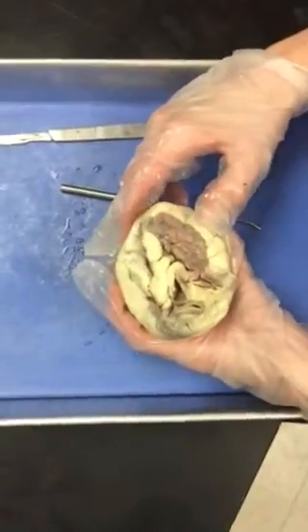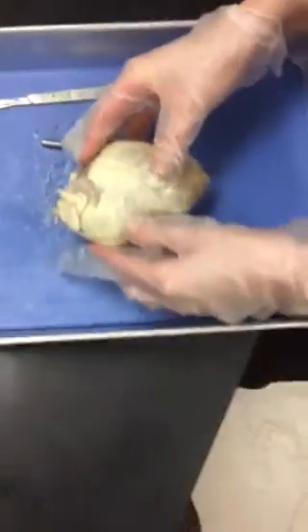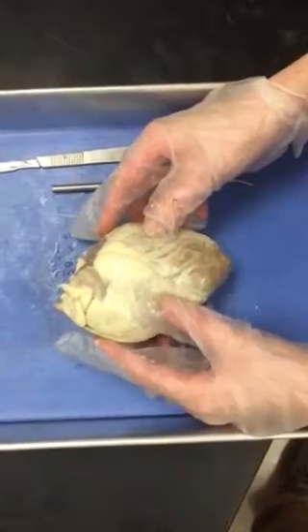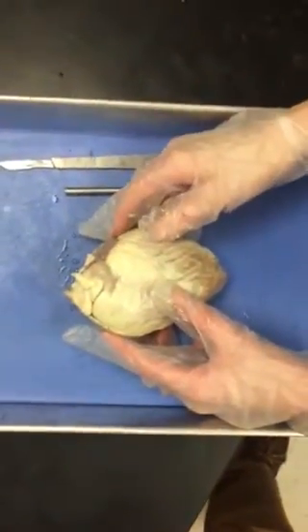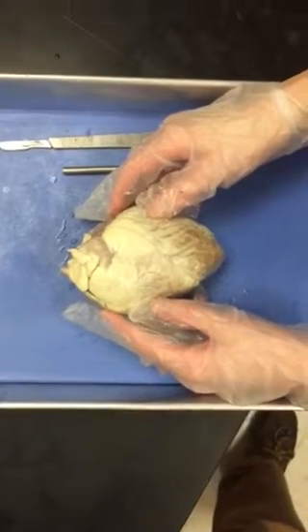We're now moving to the internal dissection. 24, place the heart with the ventral side facing you. The ventral position means you would be looking at a person's chest from the front view. Refer to your toothpick labels as needed for landmarks. Move the flags if they're getting in the way of your cuts. Add additional flags to the internal structures when possible.